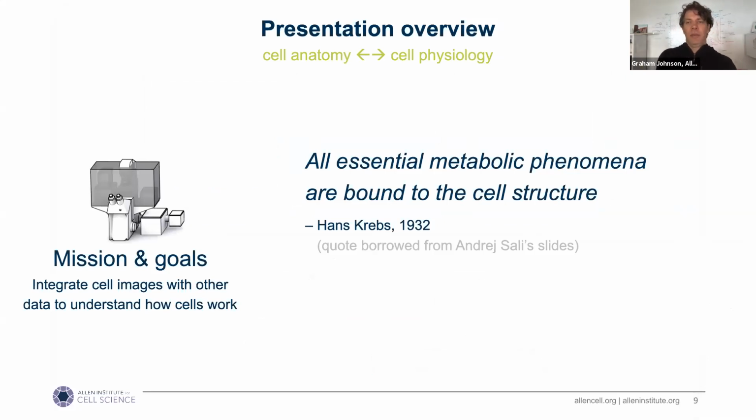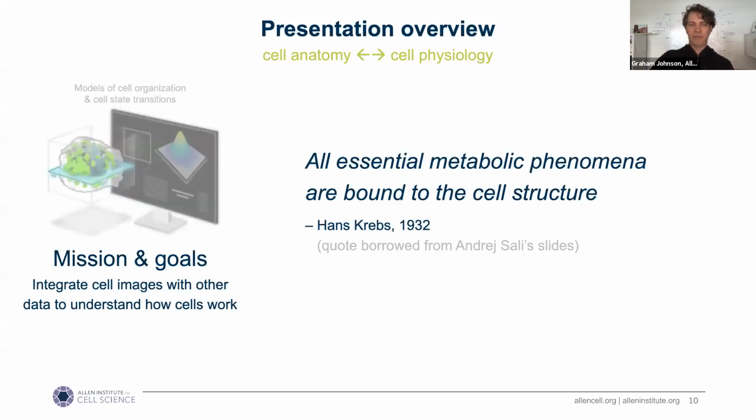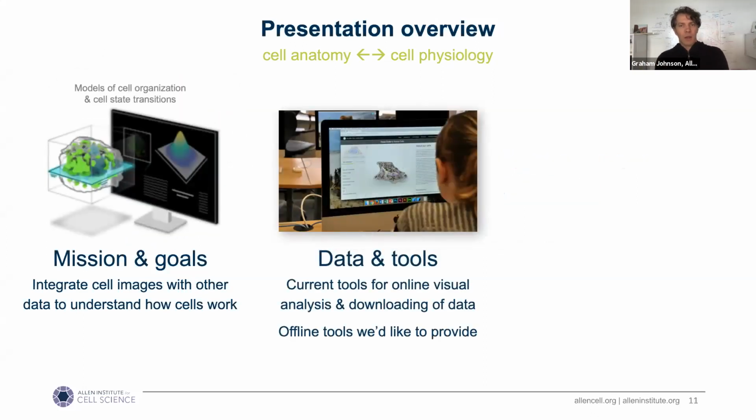I want to overview a major goal of our Cell Science Institute, which boils down to integrating the structural anatomy of cells that we can see in our microscopes with other data to be able to infer and learn the physiology of cells. I want to quickly highlight some of the data and tools we currently provide online, while also describing some of the more sophisticated tools that we hope to make available in the future.